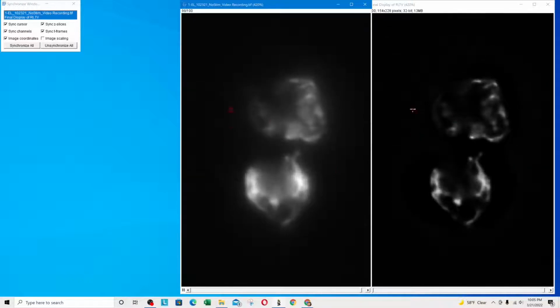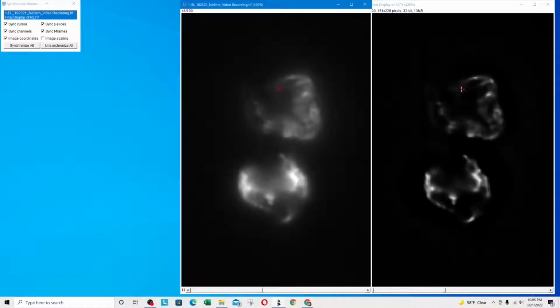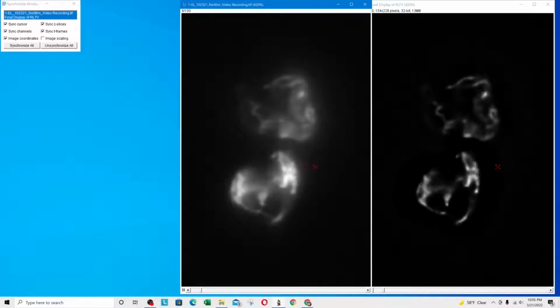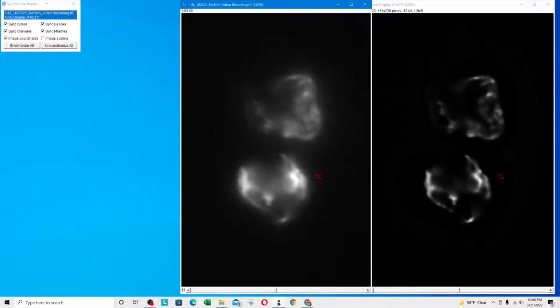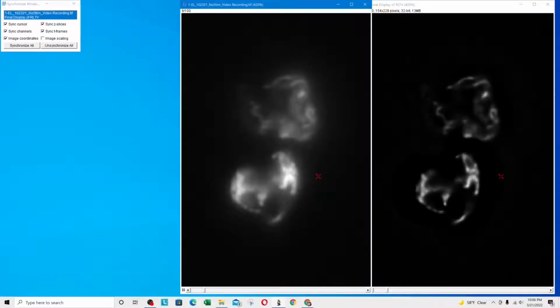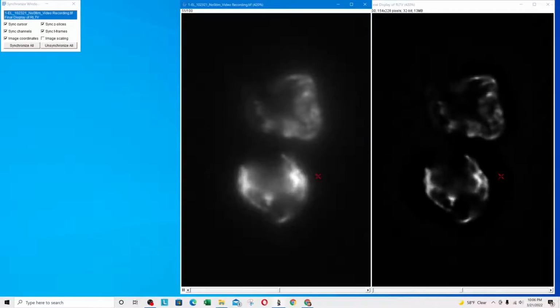Especially towards the periphery of these networks, mitochondria are extremely dynamic. They are coming together, breaking apart, forming new, and their directionality is changing. And depending on what cell type you're looking at, you could correlate that directionality change with the activity and the function of that cell type.